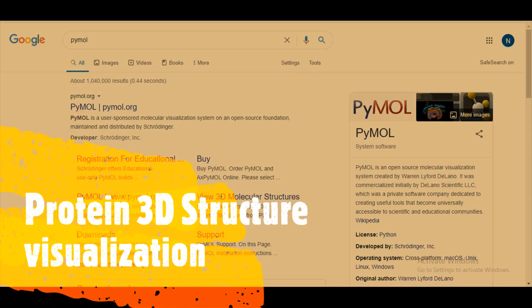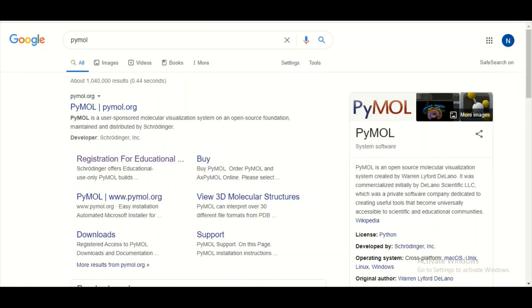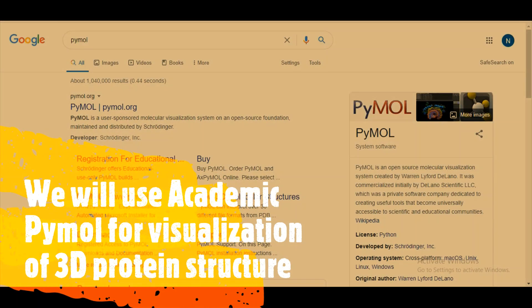In this tutorial we will talk about how we can visualize the three-dimensional structure of a protein on our local machine. To do so, you need to install appropriate software. There are many different software options available on the internet, such as Chimera, PyMOL, and many others. In this tutorial we are going to use PyMOL for the visualization of the three-dimensional structure of the protein.